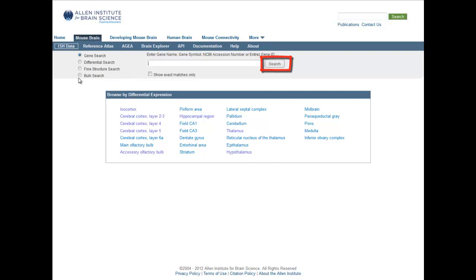If you have a list of genes, you can use the bulk search feature by selecting this radio button.